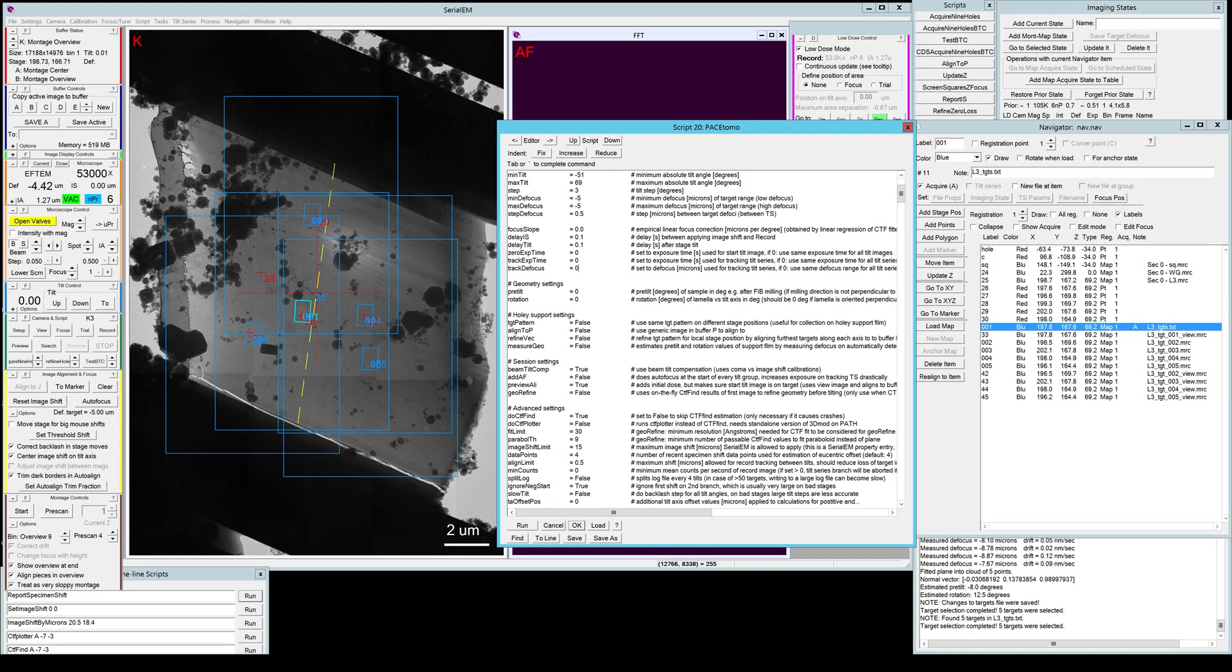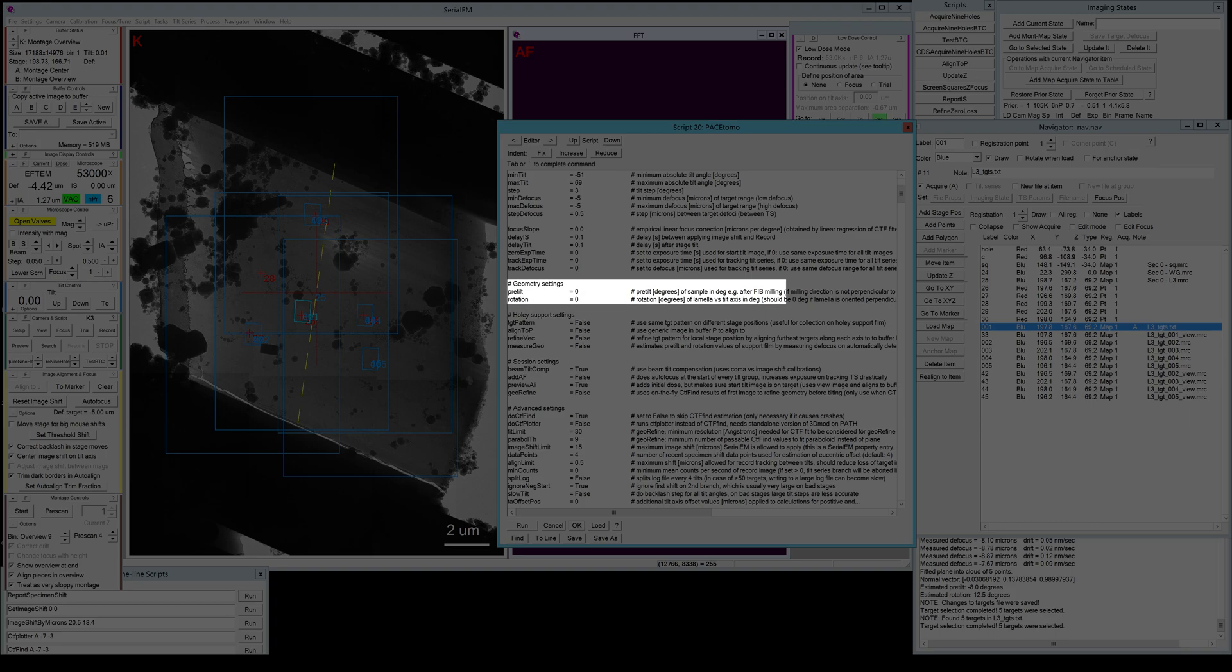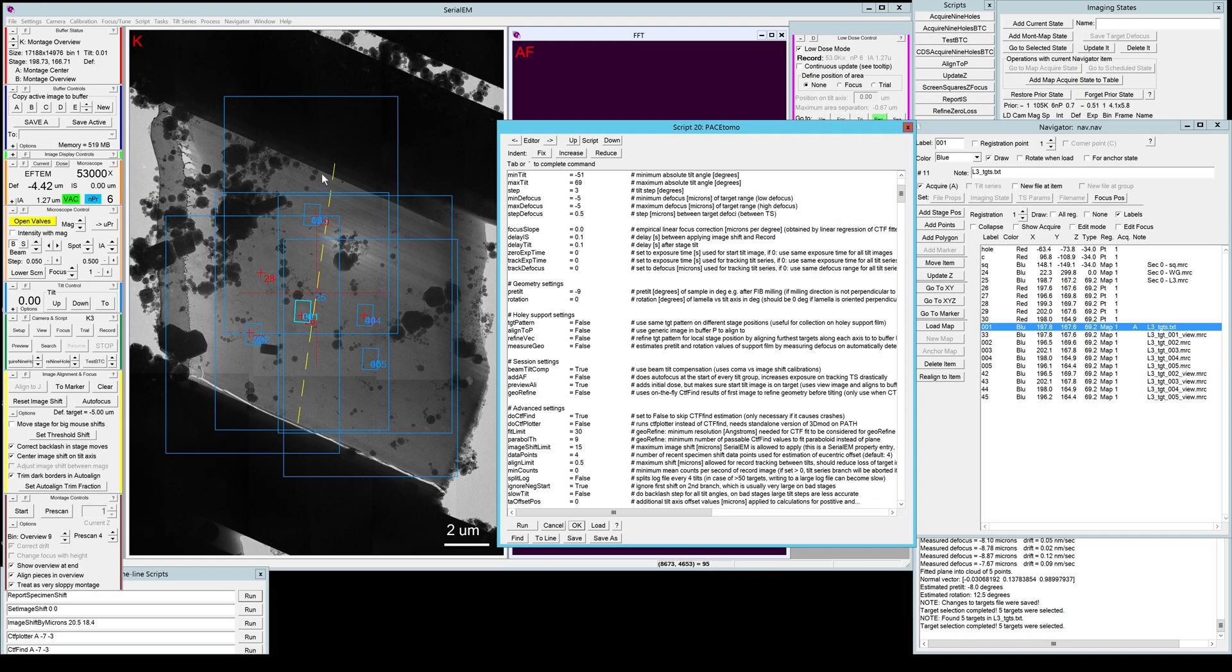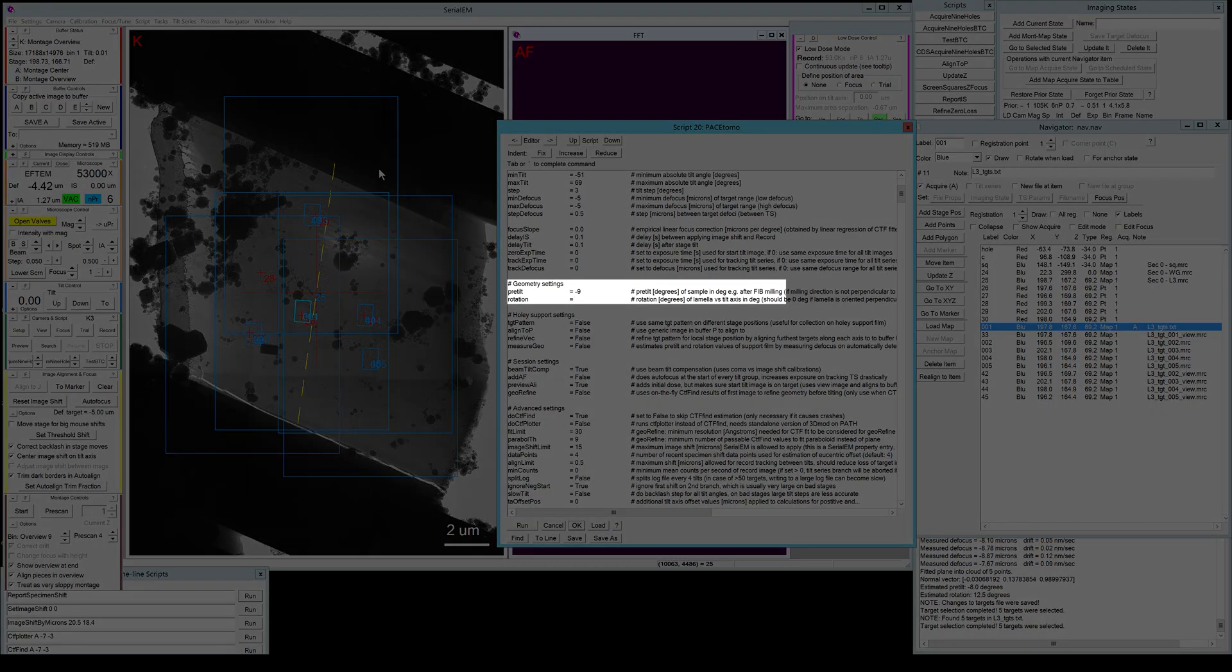The next settings are the geometry settings. Usually I would just set that to my milling angle depending on how you loaded the lamella. Of course it will be plus or minus. In my case, it is minus nine. And the rotation is just a rough estimate. As you can see, it's a bit clockwise rotated compared to the tilt axis. So let's maybe set it to 15 degrees.